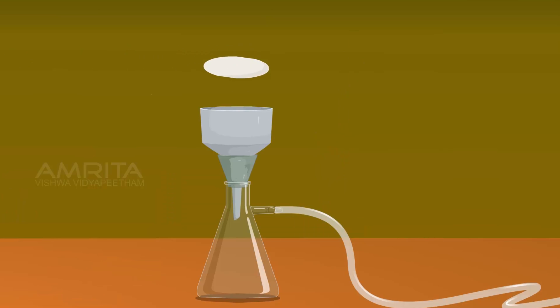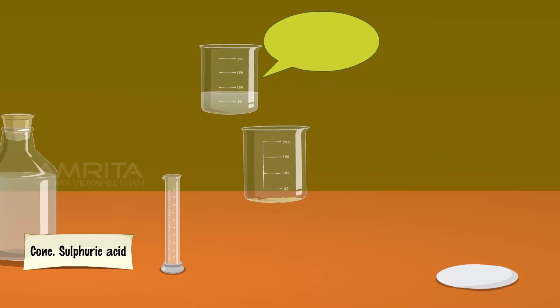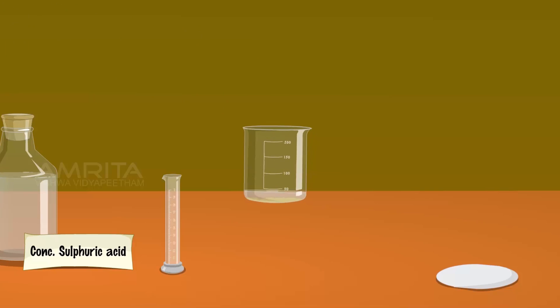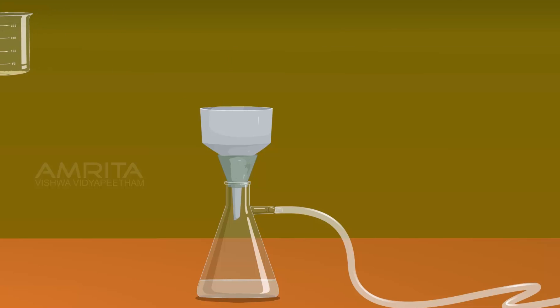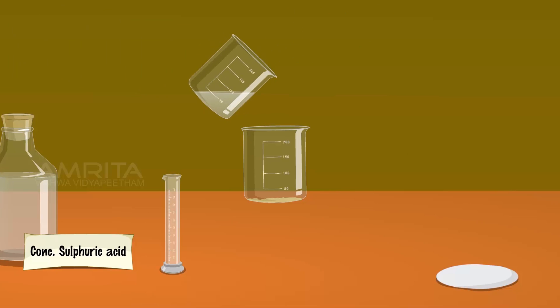Transfer the mother liquor into a Buckner funnel. Then wash the precipitate with cold water. Again transfer the mother liquor into a Buckner funnel. Repeat this once more and then filter off the precipitate.